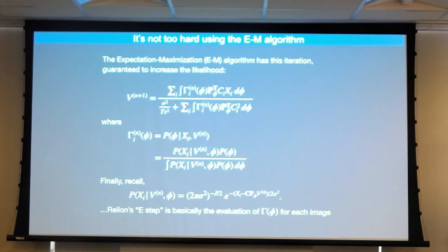usually when you reconstruct a volume, the volume does not occupy all that much of the total space of the box. And so I think the t value ought to be the ratio of the particle volume to the box volume. And I think for 2D, the t value ought to be the ratio of the actual particle image area to the total image area. If you think about it that way, then t values of 2 and 4 make sense, because when Sjors computes this tau squared, he is just computing the total squared voxel values of the entire box.